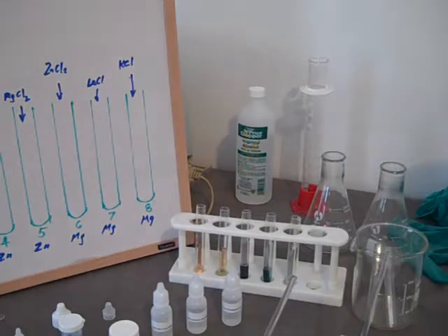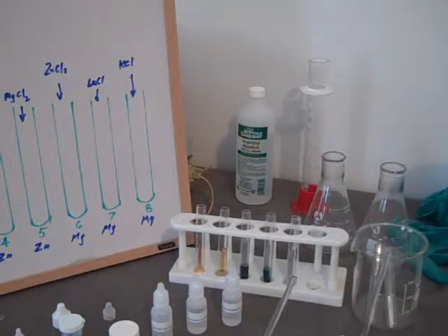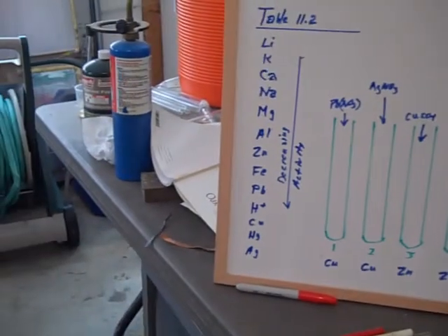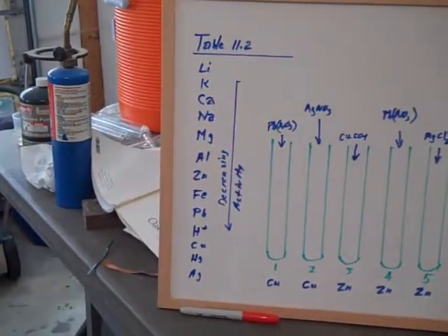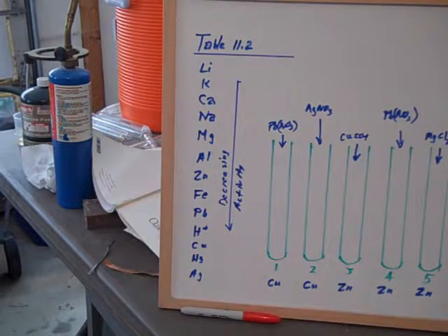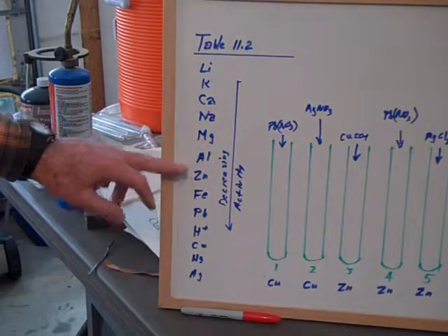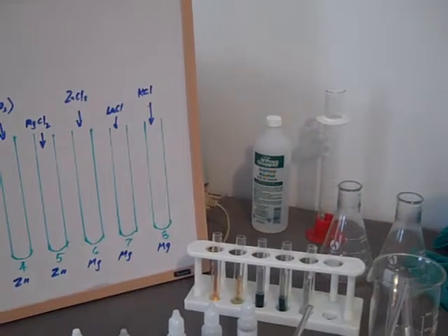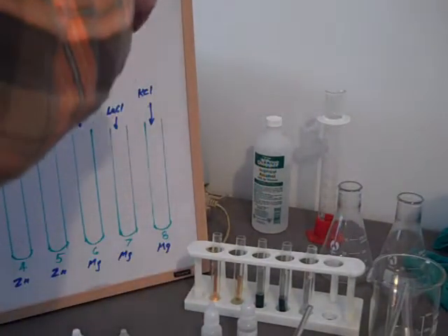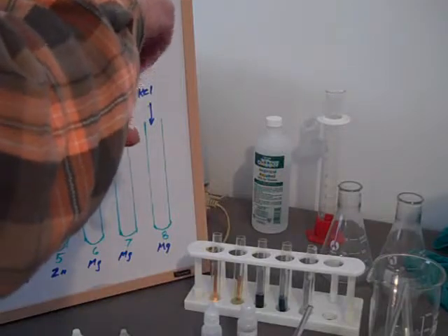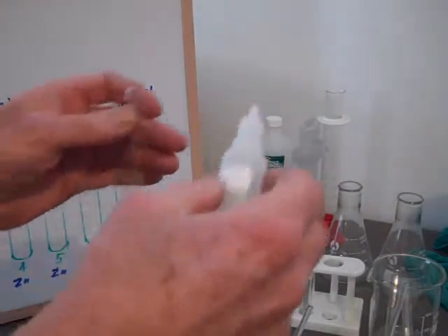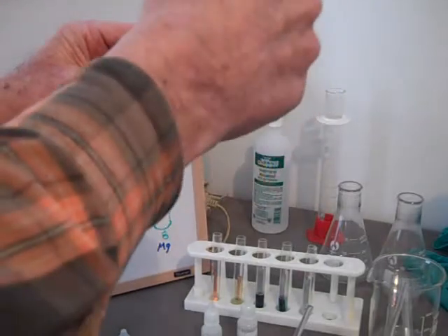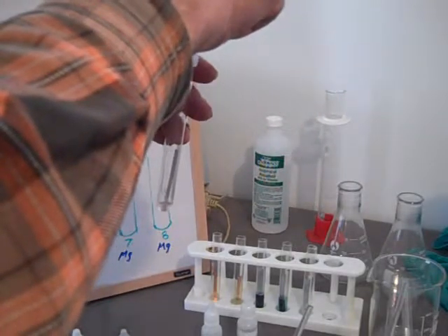Let's see what we put in number 6. Number 6 is magnesium and zinc chloride. Let's look again at the activity series. Number 6, we have magnesium metal and zinc chloride. Magnesium is more active. So for the zinc salt, we should expect a reaction. Let's see if that happens. I don't know how, I've never plated zinc. I can't remember plating zinc. I'm not sure how this will look, if we'll be able to see it. But we'll know in a second.